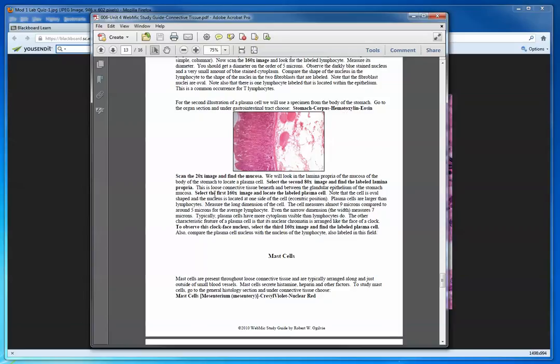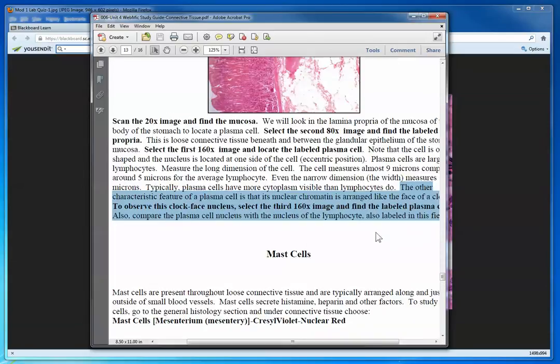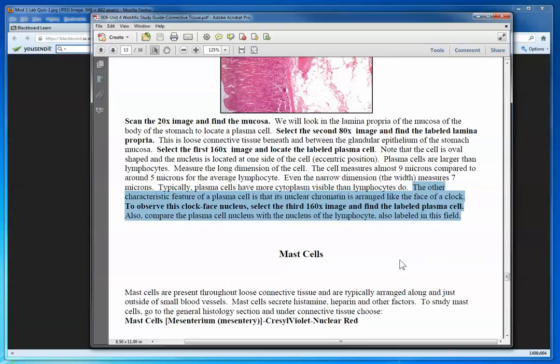You're directed to go to different magnifications, and finally the third 160x image you will find a labeled plasma cell. You are instructed here—I'm going to enlarge this—that the characteristic feature of a plasma cell is nuclear chromatin arranged like the face of a clock. To observe this clock face nucleus, select the third 160x image and find the labeled plasma cell. You can also compare in that same field the nucleus of a lymphocyte with a plasma cell.